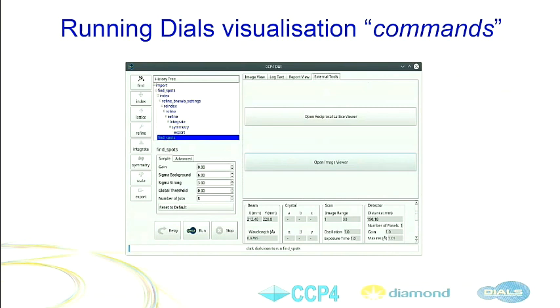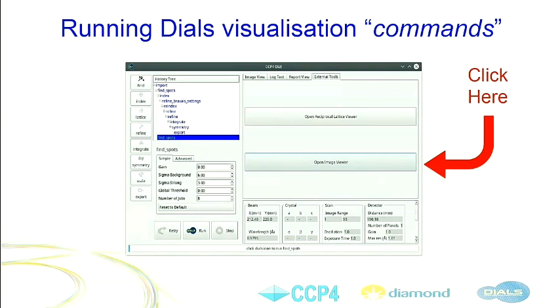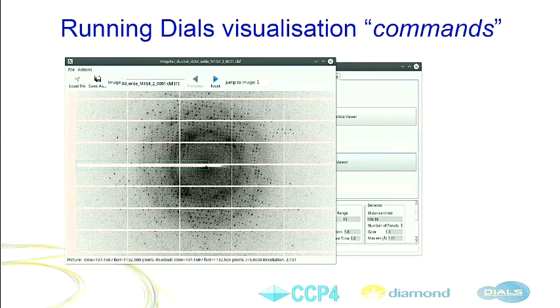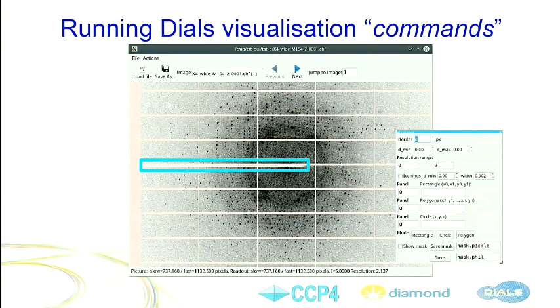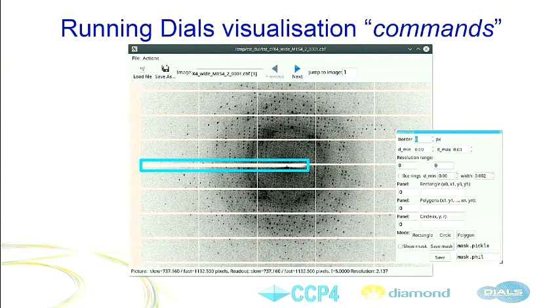The Image Viewer is not the only tool you can run. The external DIALS Image Viewer behaves differently and shows more tools we still don't have in Dewey. Both the Image Viewer and the Reciprocal Lattice Viewer in the external tools are connected to the position where you are in your processing. The Image Viewer has a masking tool we plan to add to Dewey soon — you can tell DIALS not to take into account certain areas, like where the beam stop is. You draw the mask, save it, and Dewey will pick up the result and use it for the next step, in this case spot finding.